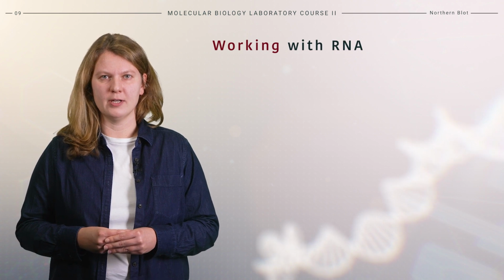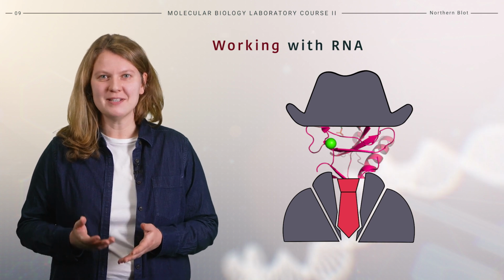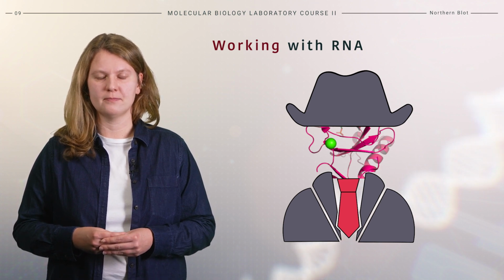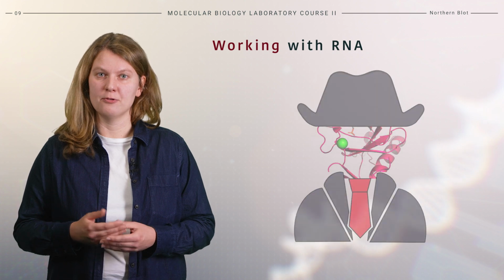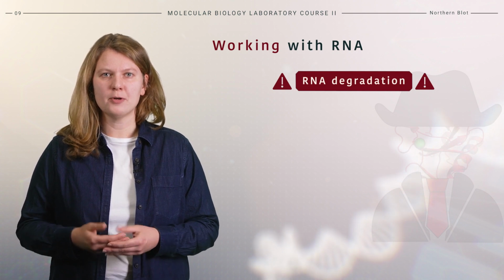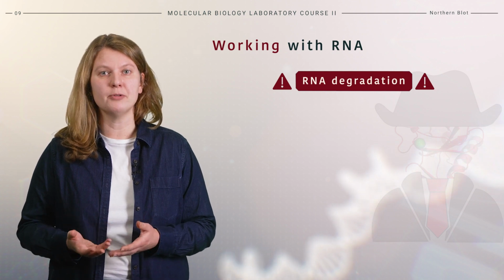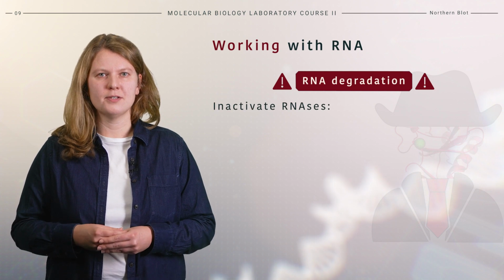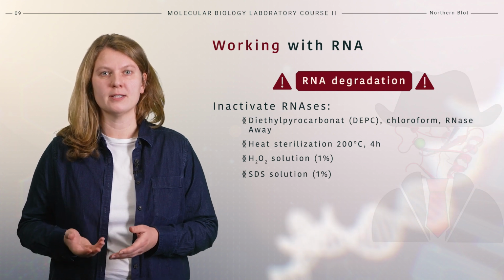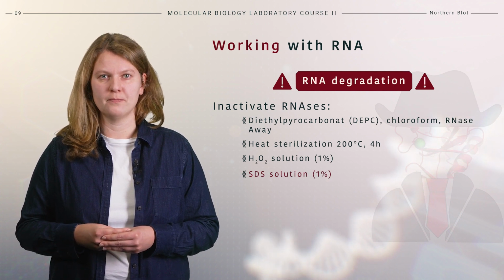A common problem during RNA isolation is the presence of ribonucleases, or RNases. These enzymes are extremely stable, universally present, and generally do not require cofactors for their activities. The presence of RNases during the RNA preparation can degrade the RNA, leading to the loss of sample. To avoid problems with RNases, purification procedures should take place in the presence of RNase inhibitory agents. Typically, these are strong denaturation agents such as guanidine salts, sodium dodecyl sulfate, or phenol-based compounds. The commonly used one is sodium dodecyl sulfate solution.